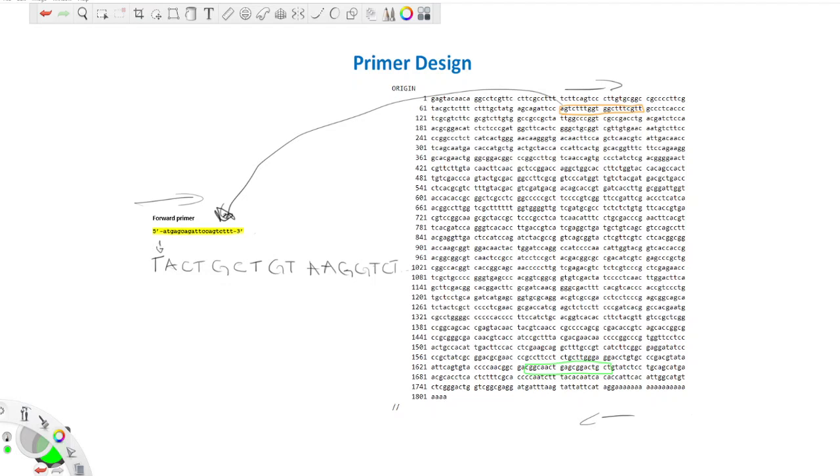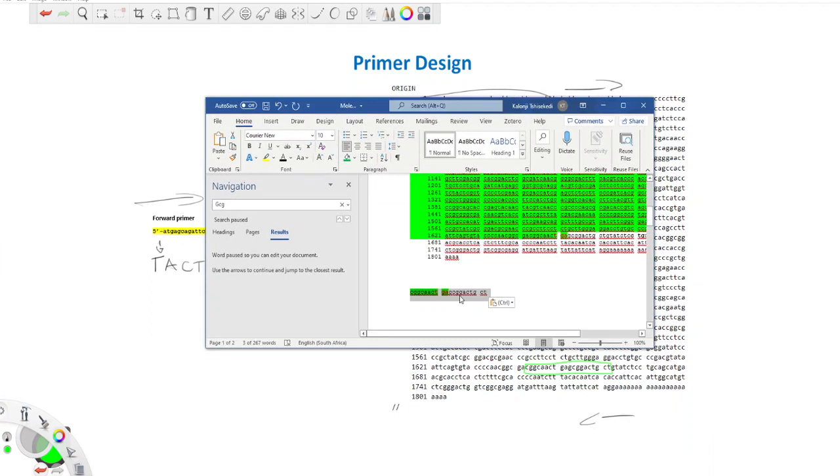So we are just selecting it now, and I'm going to show you how it happens once we have the region. We are going to create a complementary base pair of it, which you're not going to see now at the moment, but once I'm done with it here. In fact, let me just show you. Actually, this is where I'm selecting it from.